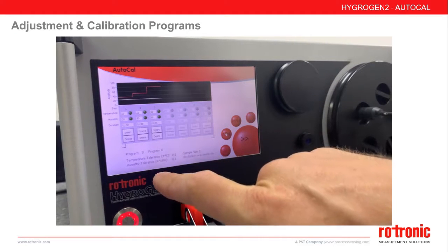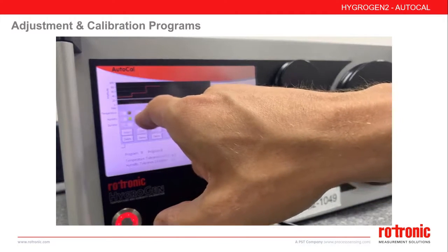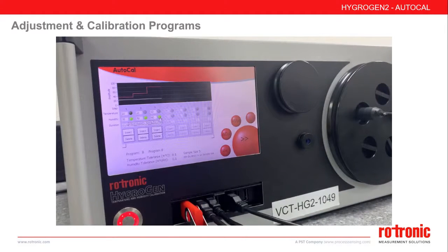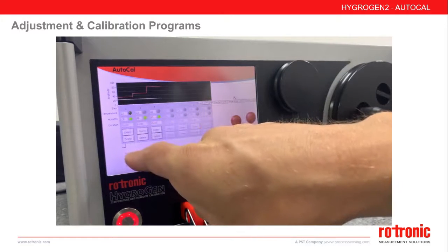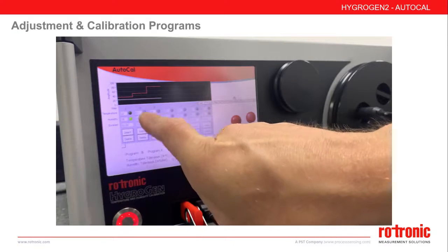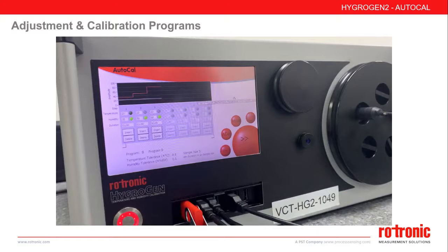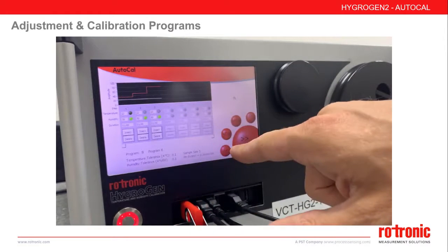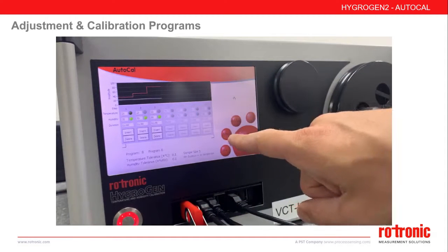If we wish to adjust, we have to specifically select the radio buttons on the points we wish to acquire data and apply adjustments. By selecting these 3 points, Autocal will acquire the humidity conditions at each step and apply the adjustment to the probe at the end. In this case, this would be a 3-point humidity adjustment with no temperature adjustment.